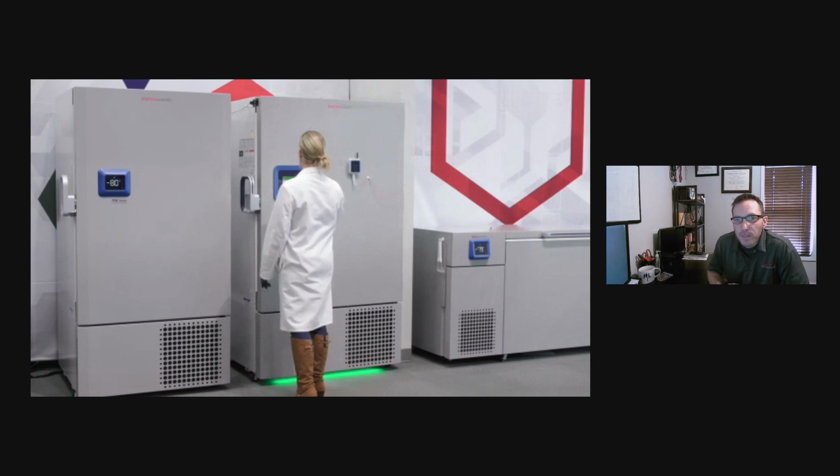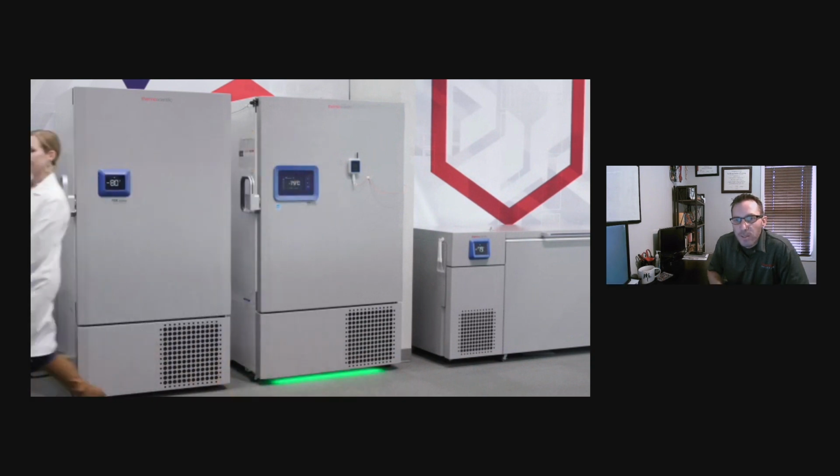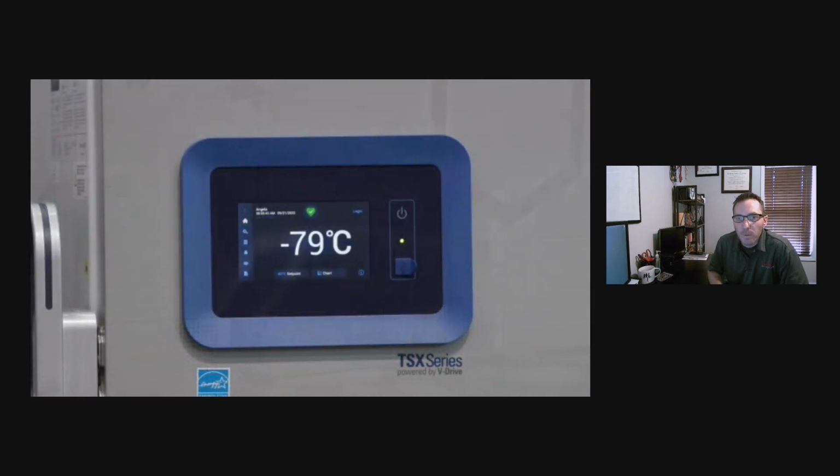So as you'll notice, as we zoom back in on the user interface, that was a 60-second door opening. It was originally below -80 in the cabinet. You will see that temperature throughout the cabinet rise as that heat is circulated. If you were to progressively open that cabinet door again in the next few minutes, that temperature is going to rise and rise, much like the graph that we were looking at previously. So it's critical that we, one, minimize our door openings, two, minimize the time that we open the door, and three, we know where our samples are so that we're not spending time with that door open for no apparent reason.